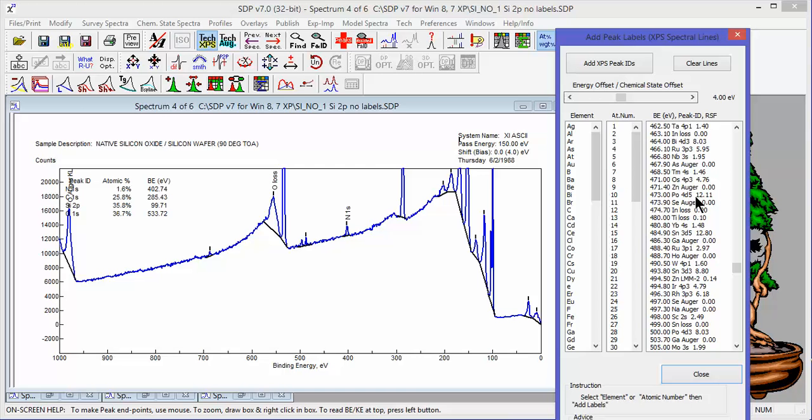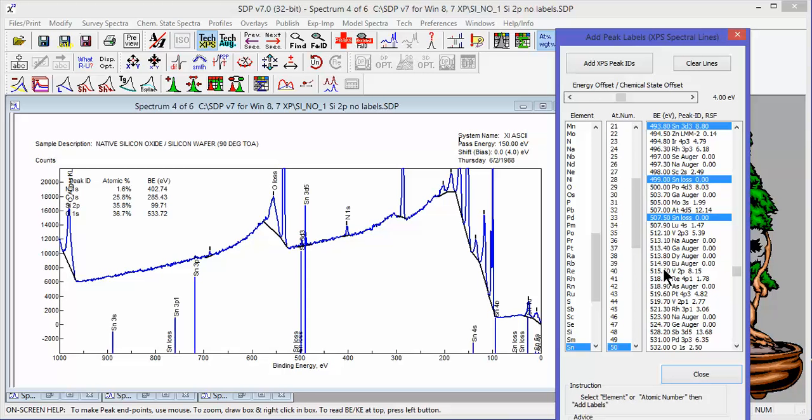Now, what is likely? What has a peak there, which should have been a very big peak if it was pure, but in this case we just have a tiny amount, so it has to be a major signal. Gallium, tin's a real possibility. Holmium, no. Here's the other tin. All right, we've got a doublet there. So let's choose tin. And it lines up in multiple places, so good, we'll add that.